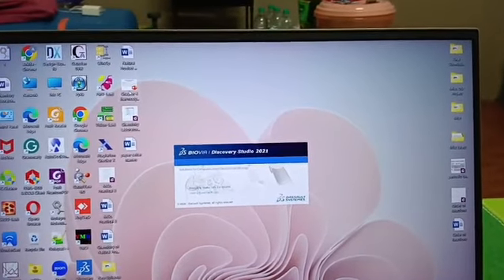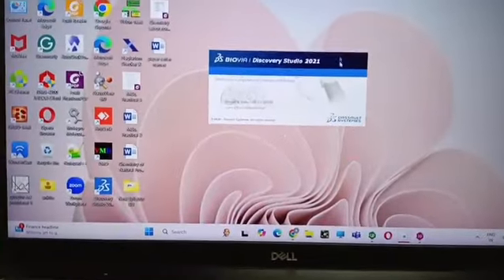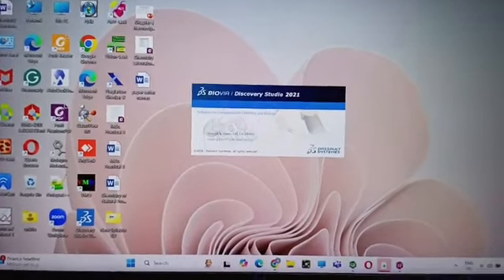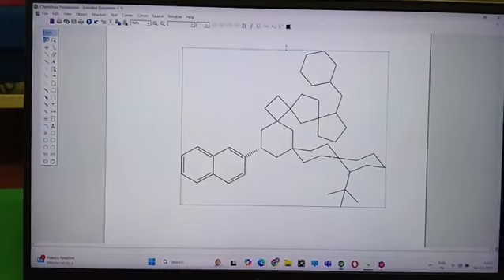That's how you do it. Once this software is getting opened, we are doing another job on the Chem Draw. So I am going there in the Chem Draw. So you see here we are in Chem Draw. You see structure preparation, you have known.